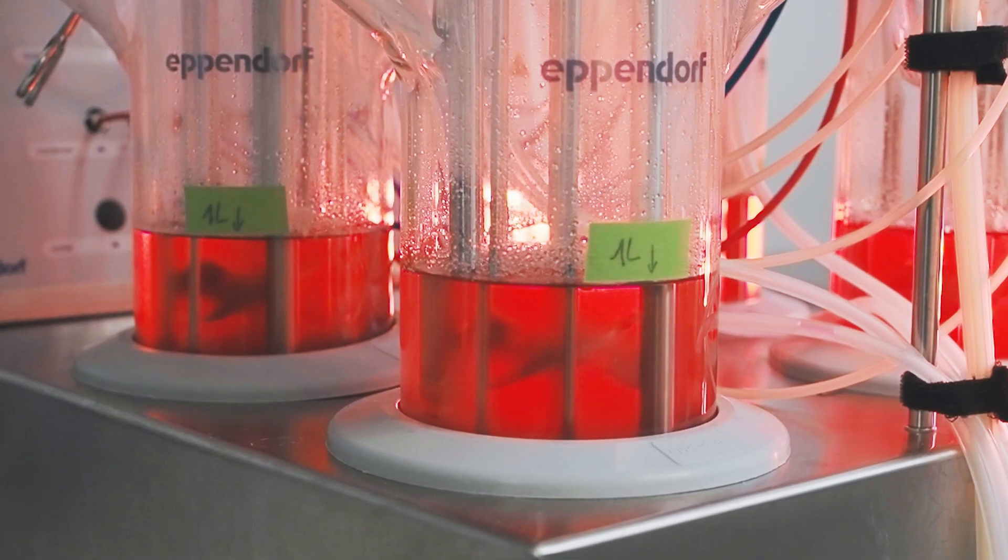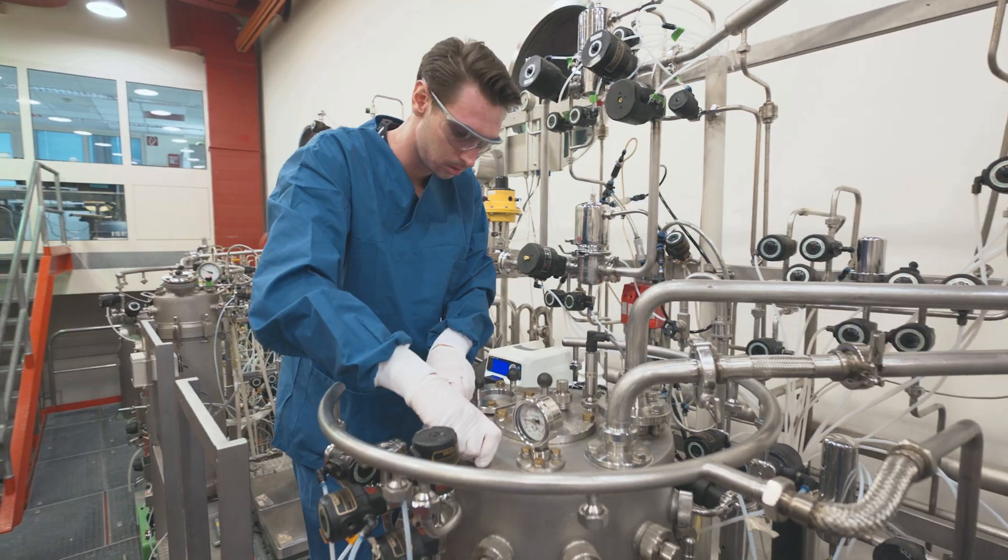Fermentation is the first and highly critical step in the manufacturing process, as it already defines the final quality and quantity of the product.